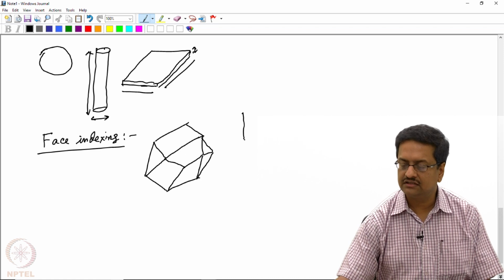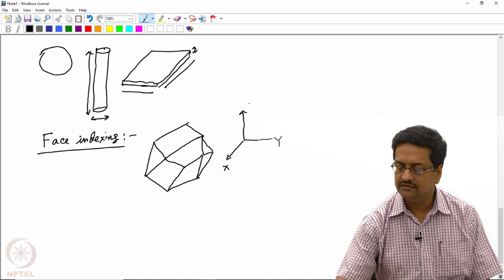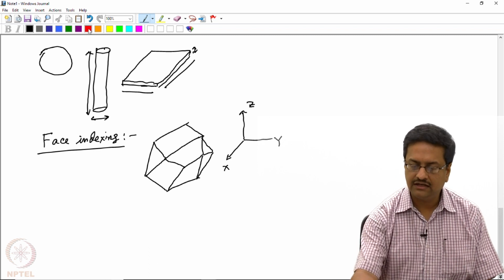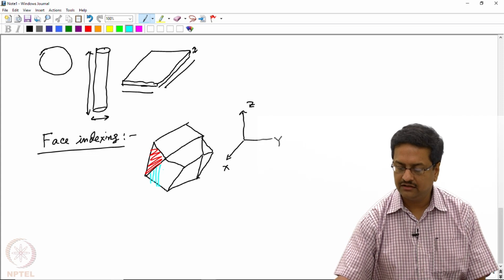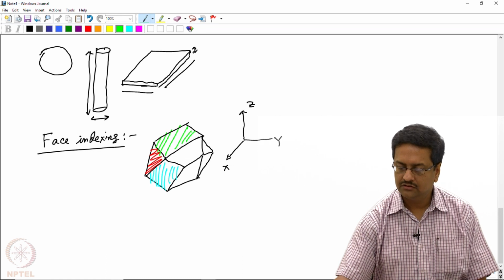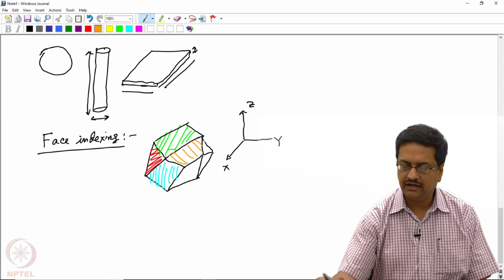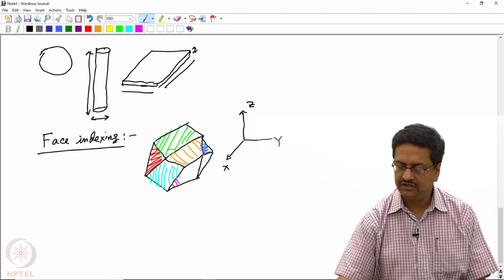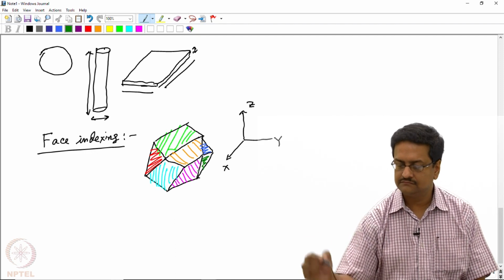the actual orientation of the crystal with respect to the beam and identify which is x, y and z direction, and then eventually can identify each and every exposed face by the corresponding Miller indices. So every face that I am marking with different colors can then be identified using different HKL, and then one can apply appropriate corrections using these indexed faces.